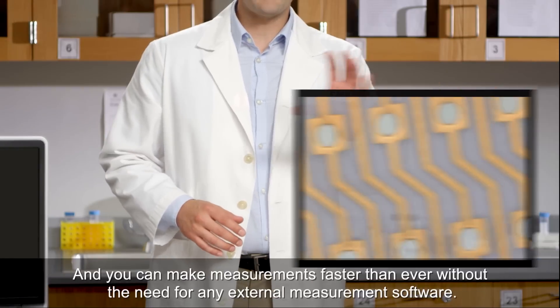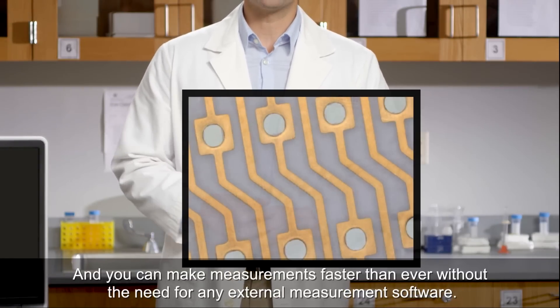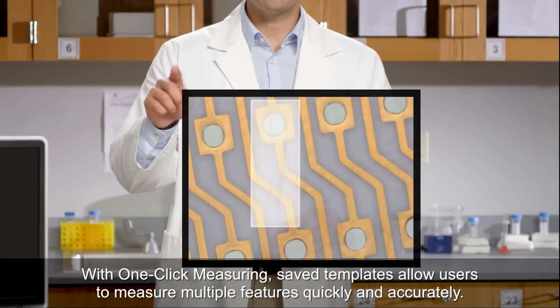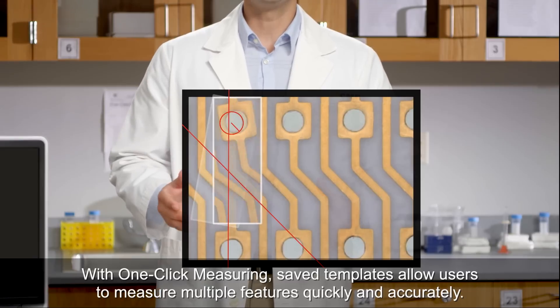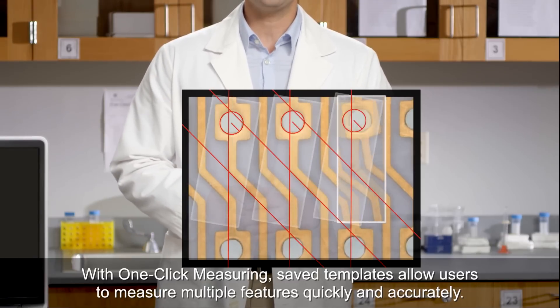And you can make measurements faster than ever, without the need for any external measurement software. With one-click measuring, saved templates allow users to measure multiple features quickly and accurately.